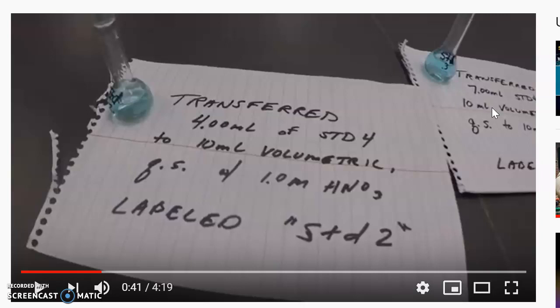Standard number 1 has 0 copper in it, it's just nitric acid. We have standards 2 and 3, which have concentrations between the most concentrated and nothing. So we have 4 different known concentrations. You have to calculate the molarity of the other 2, which is why I'm not telling you those. We'll put them into the spectrophotometer, get their absorbance, and create a curve.